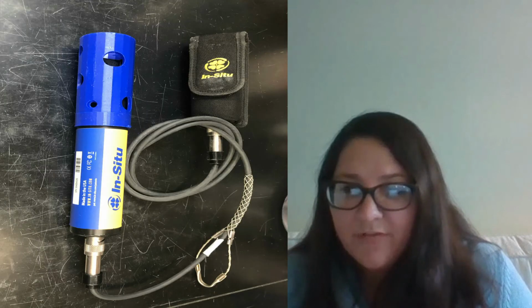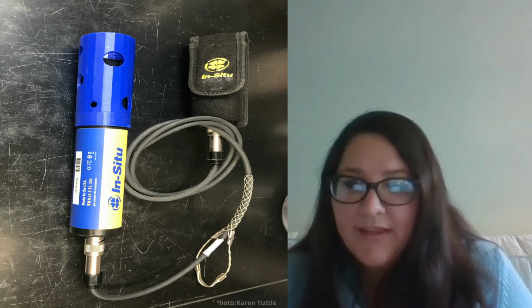They're just able to really narrow down a wavelength a little bit better than a colorimeter, and get a lot more accuracy and precision between measurements the way we do it. So we use the spec for things like nitrites, nitrates, phosphates, ammonia, and then we also use what are called multi-parameter meters or sondes for a lot of the physical measurements that we take.